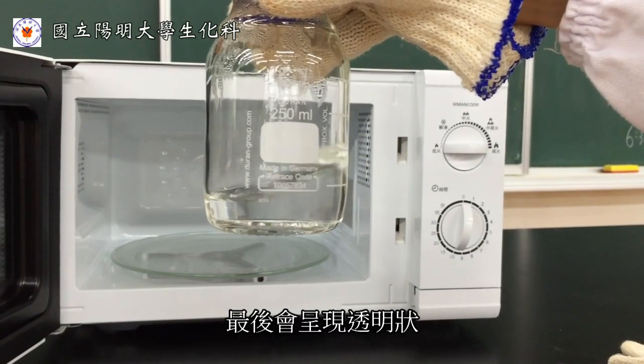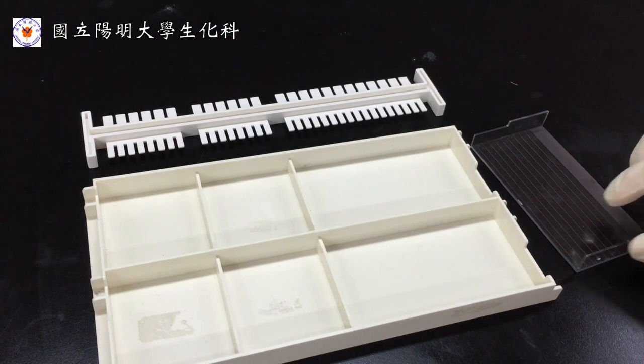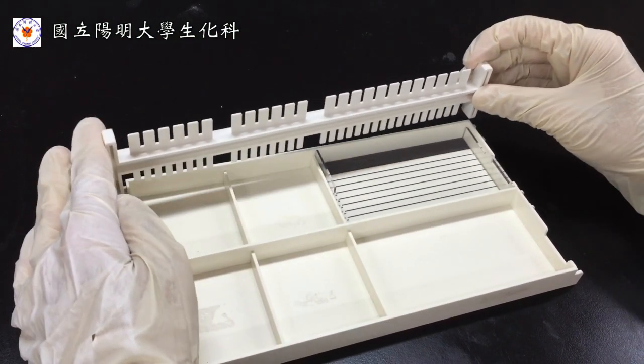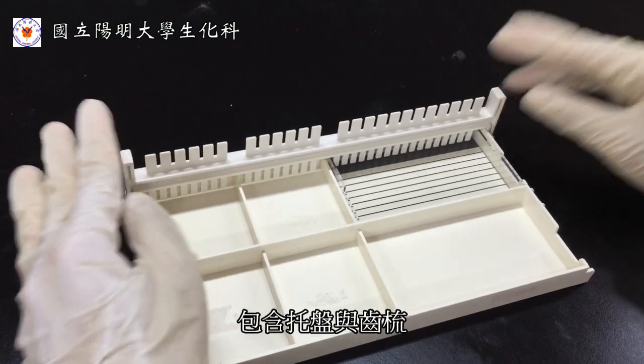Eventually, we anticipate the solution to be transparent. At the same time, we assemble the gel-making module, which is comprised of the tray and the comb.